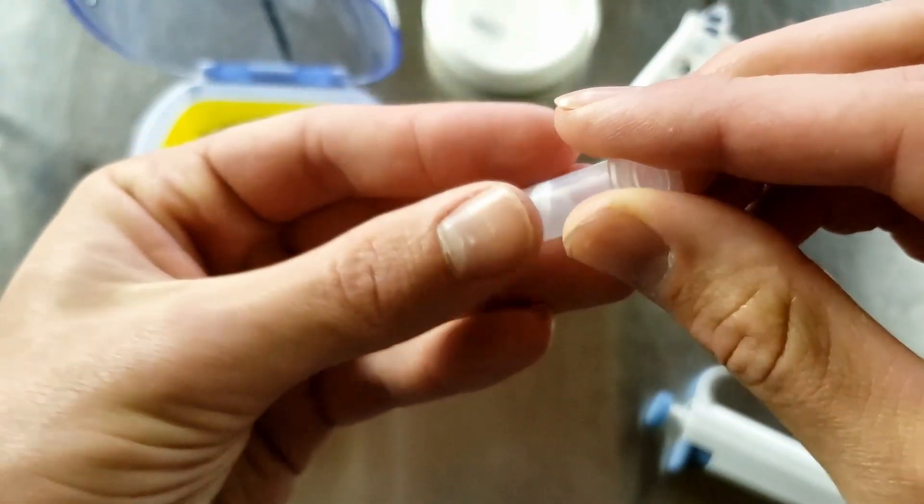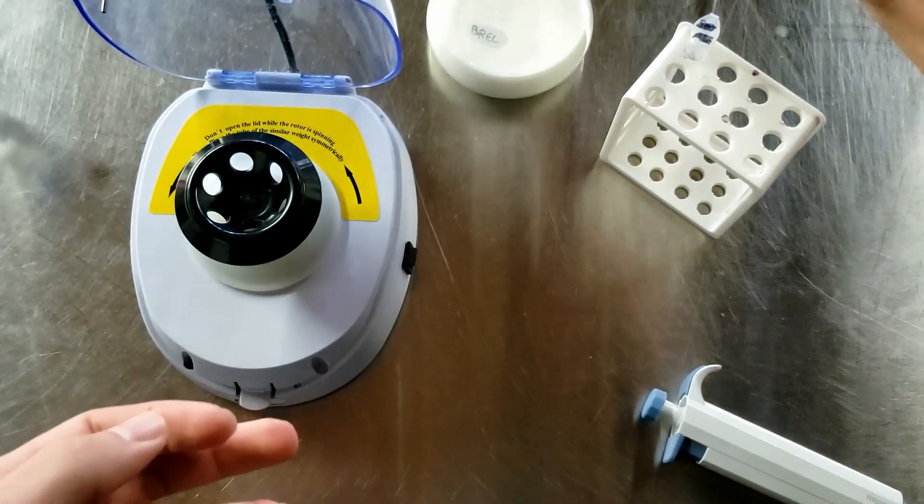Two or three washes is usually sufficient to wash away milk residues. To produce more lactase enzyme, you can spin down the milk, pour off the supernatant, add more of your K. lactis culture, spin again, pour off, and add more culture — concentrating a relatively large volume even with only six centrifuge slots. You can easily concentrate about 50 milliliters of culture, then combine all pellets into one tube before proceeding.